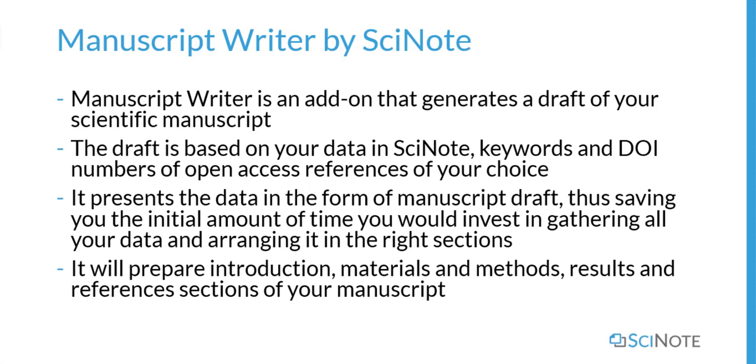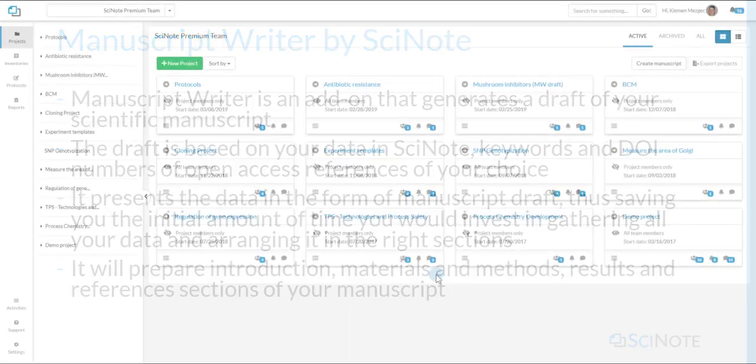It will prepare introduction, materials and methods, results, and references section of the manuscript.